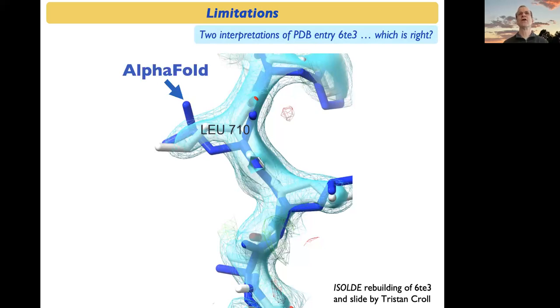And ask yourself, does that AlphaFold model fit the density? Well, superficially, sure, kind of goes in the right place. But if you look in detail there, not really. The blue atoms are out of density. And if you look at the other blue atoms around that structure, they're often a little bit out of density too. And this structure is pretty high resolution. So it actually is telling us something about where those residues really go.